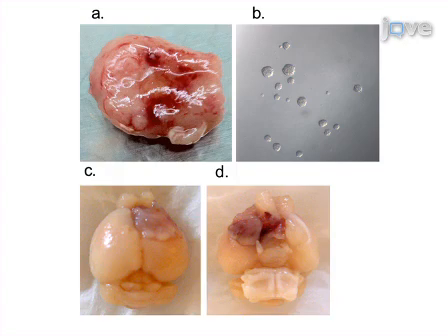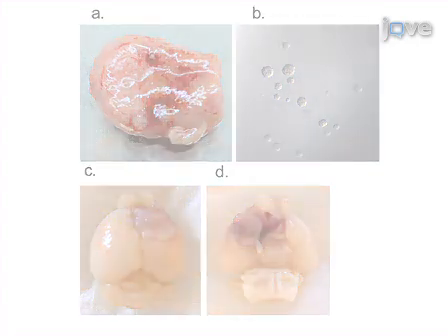We can compare this explant method with xenograft transplantation and in vitro sphere-forming assay for screening of novel anti-cancer agents. Once you obtain the tumor tissues in the laboratory, the procedure for this experiment can be completed within 1 hour. This new assay is relatively easy to perform and reproducible. After dissociation of treated tumor explants, we can combine with in vitro experiments.